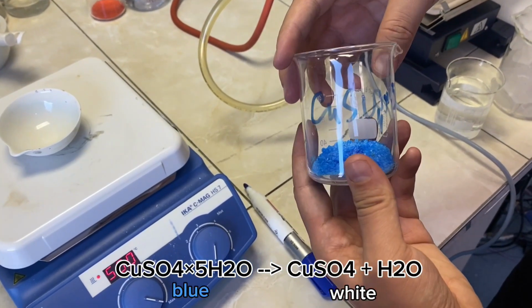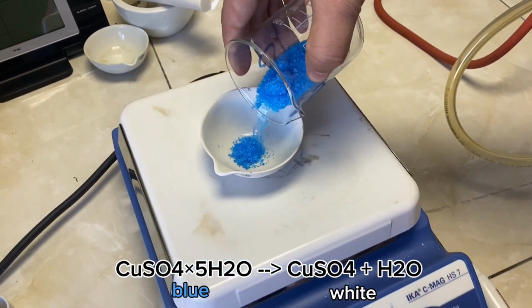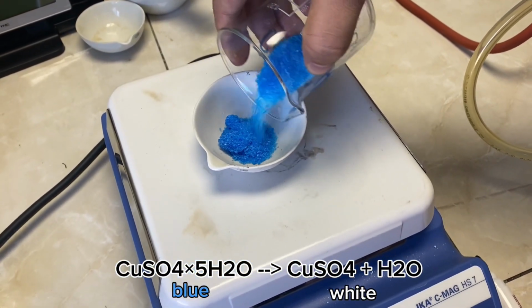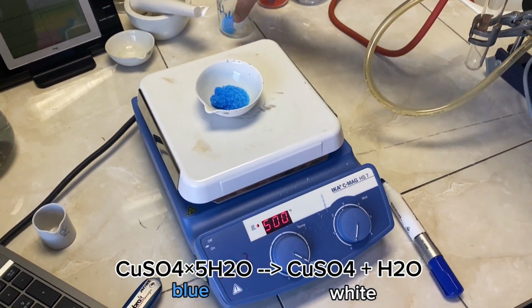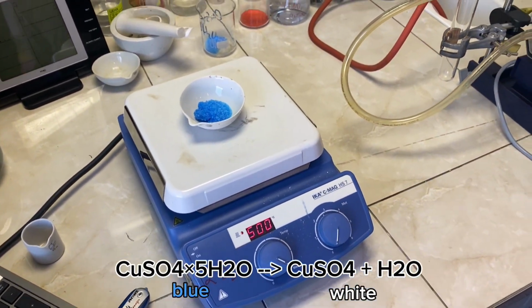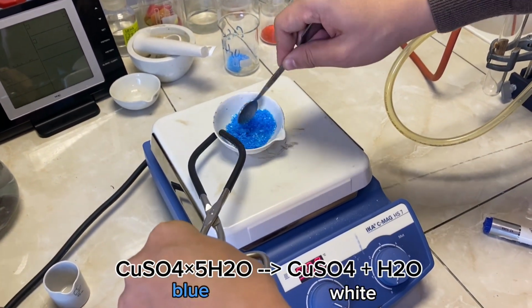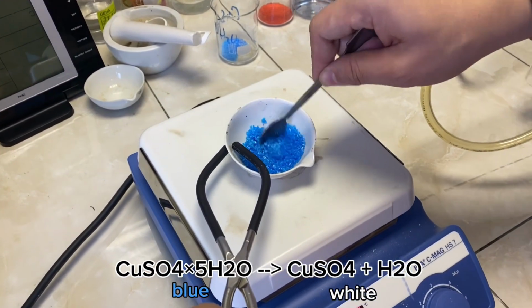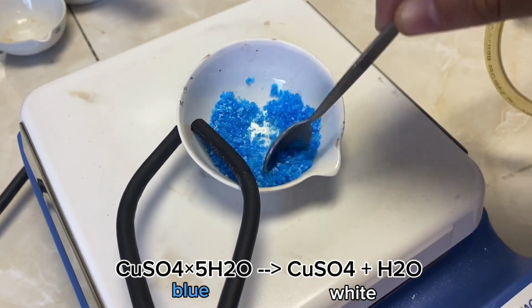So let's take copper sulfate pentahydrate and transfer it to the evaporating dish. The heating plate was set at 500 degrees. After you transfer, you need to leave it for 1-2 minutes till you reach the required color. And during the heating, you need to stir using the spatula for even heating of the crystals.